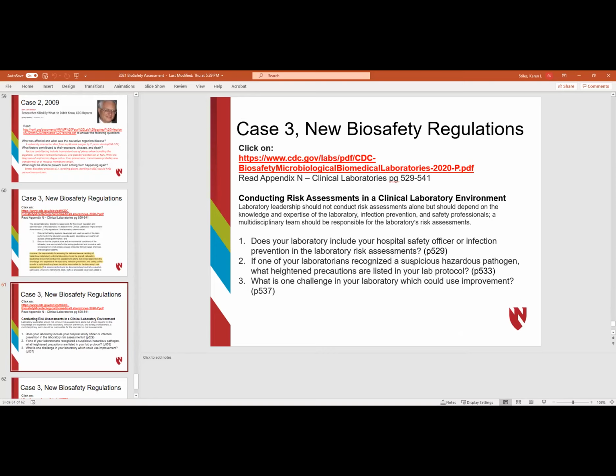So the other questions I had on the other pages was just for you to ponder over. Do you include a safety officer? That's not for me to know, but for you to think about. If you don't, I highly recommend it. I want to make sure that some of your laboratorians are trained in what we call that LRN protocol, that they recognize the suspicious organisms.